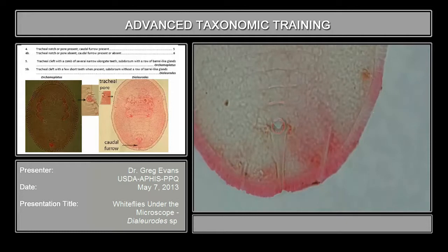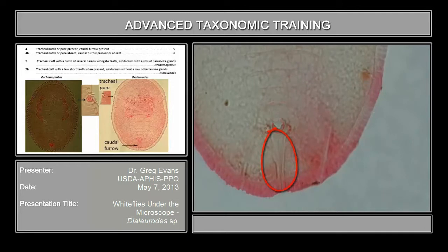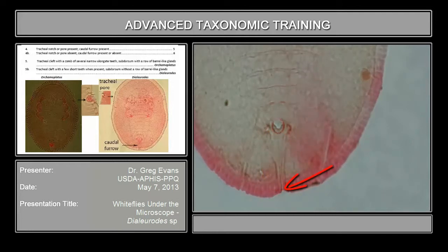Here's the caudal furrow down here. You can see it's differentiated from the rest of the sub-margin, and down here is the tracheal furrow area.